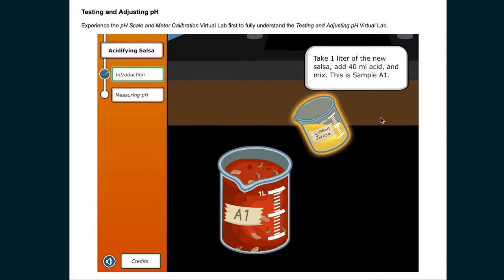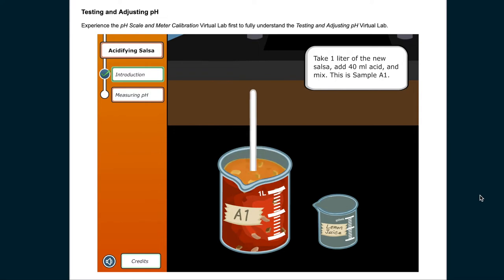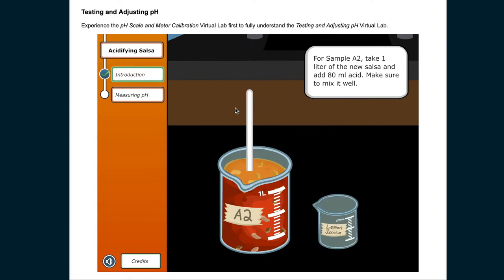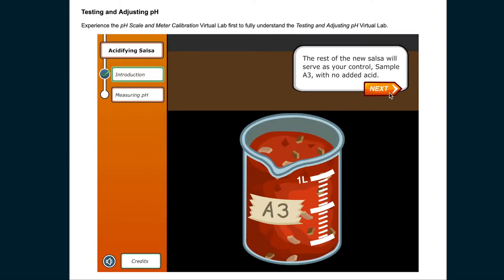Take 1 liter of the new salsa, add 40 milliliters acid, and mix. This is sample A1. For sample A2, take 1 liter of the new salsa and add 80 milliliters acid. Make sure to mix it well. The rest of the new salsa will serve as your control, sample A3, with no added acid.